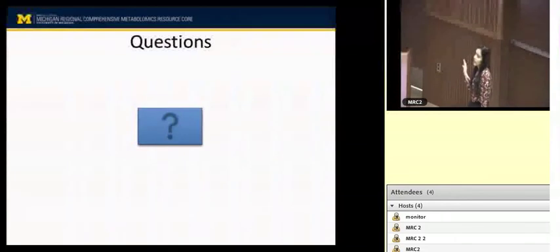So in general, I said relative response to internal standard. For metabolomics, and lipidomics is a part of metabolomics, when you do internal standard normalization, you don't actually have an internal standard for every compound, for untargeted. Same is the case for lipidomics, but it's better because we have classes here. So we know where to go for a particular class. For PC, we have an internal standard PC, so we use PC for PC. That's the general idea. But in metabolomics, that's not the case. There are no classes in metabolomics.